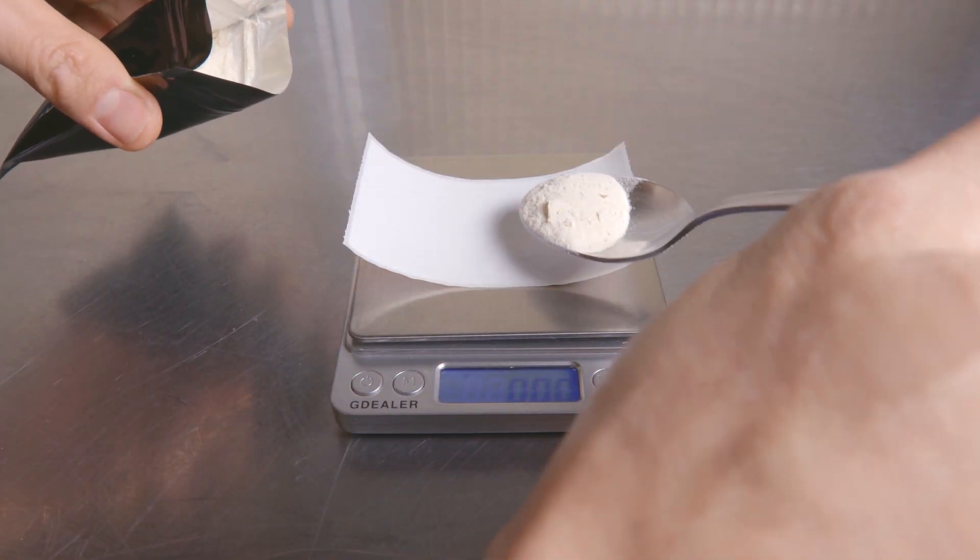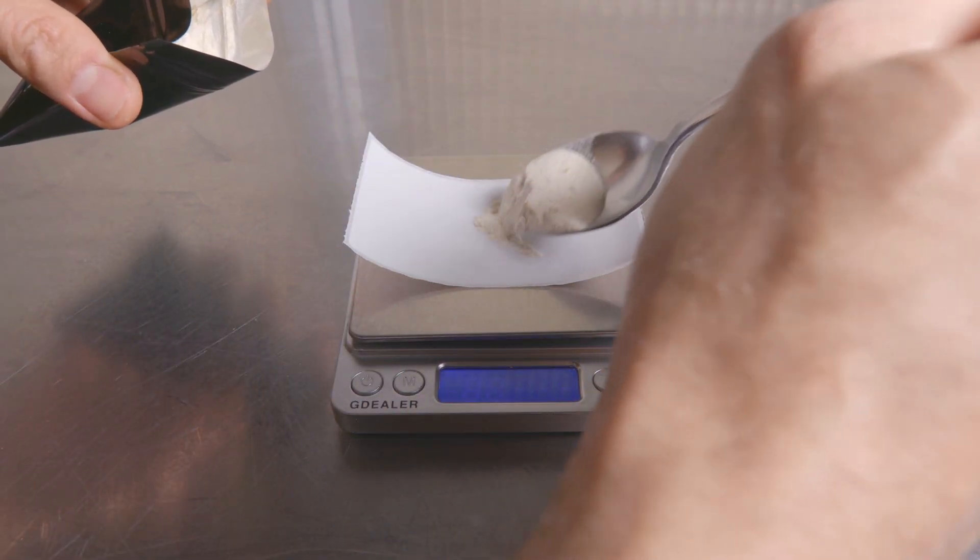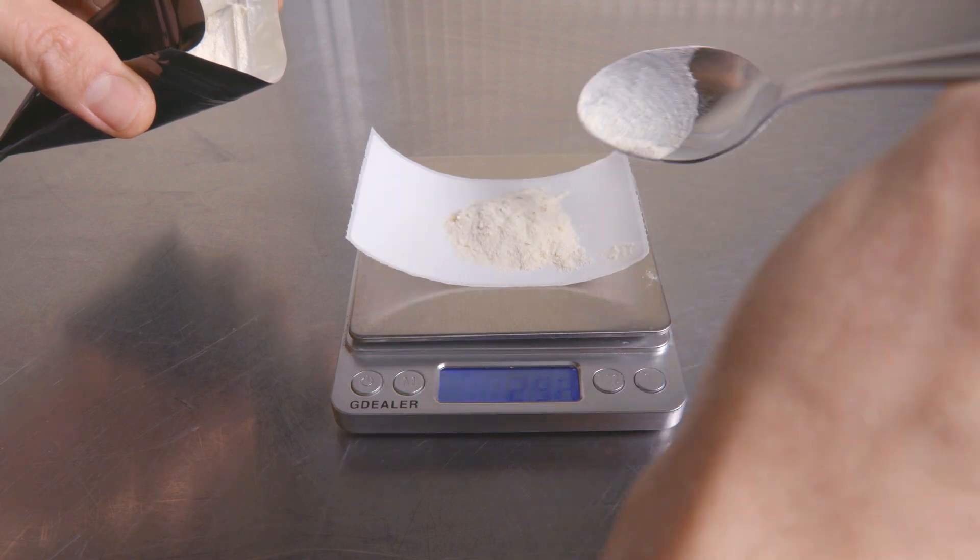The first thing you're going to want to do is measure out your ingredients. We're using the pre-mixed agar media that we offer in our shop, so if you don't want to fuss with making your own, pick some up at FreshCultivators.com.